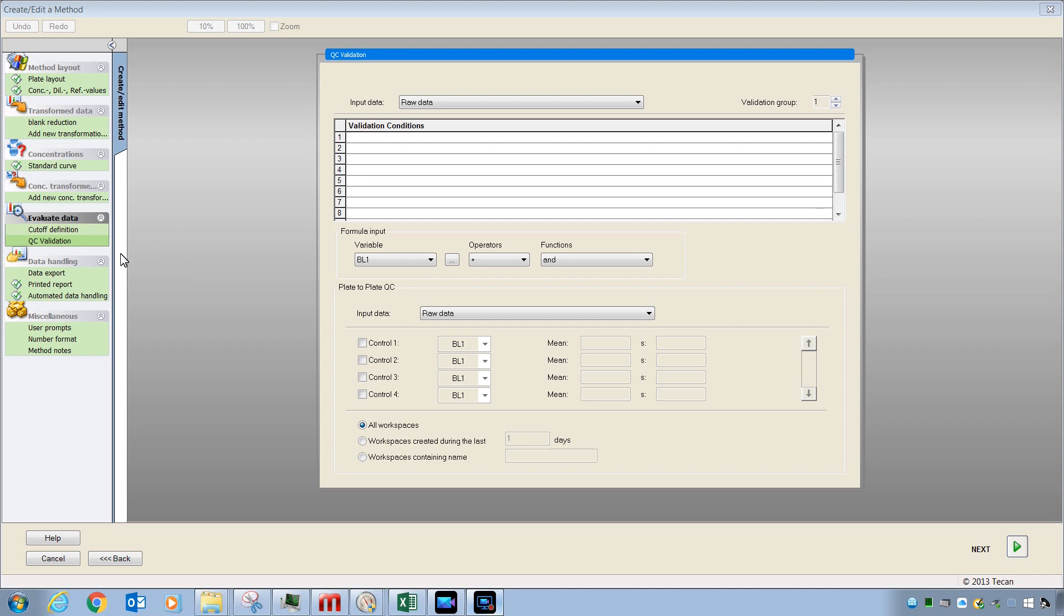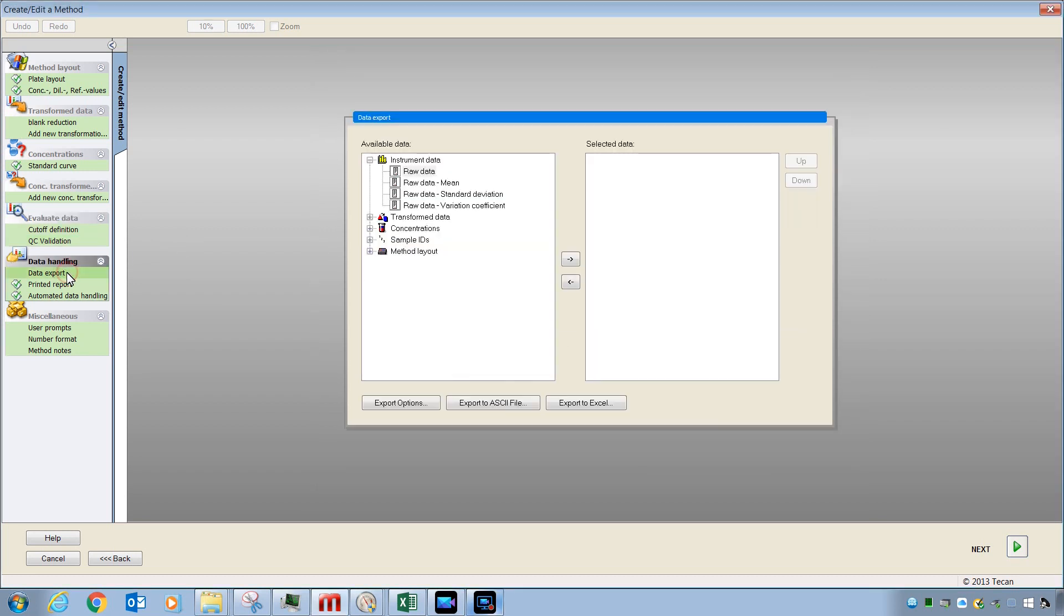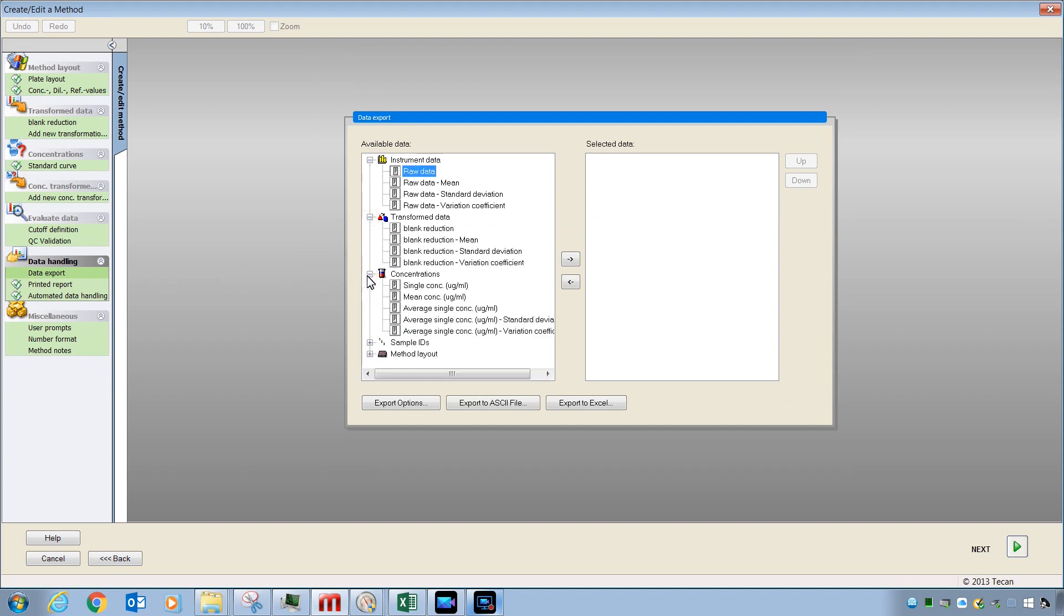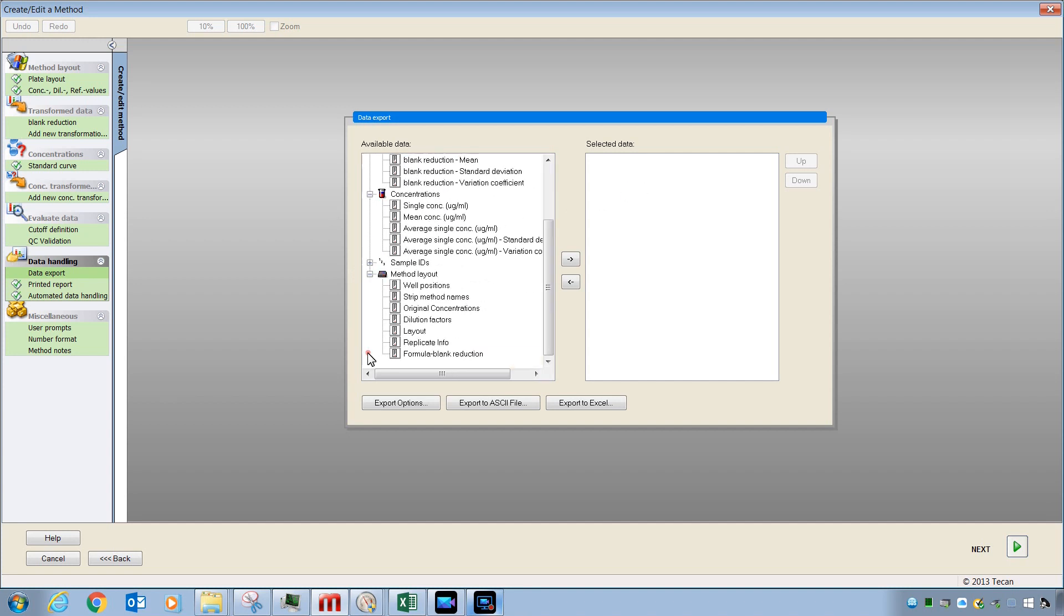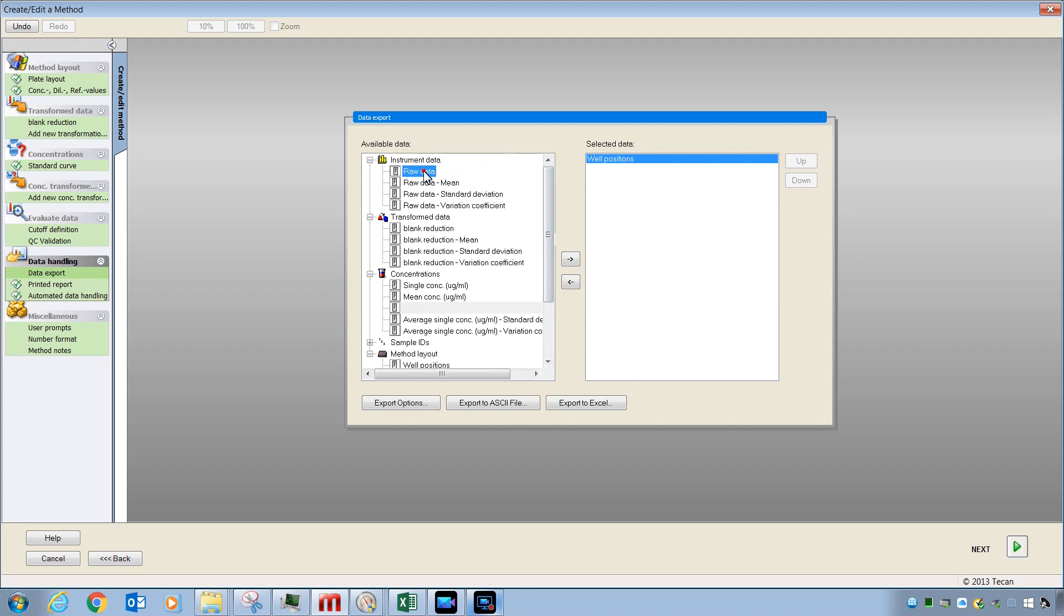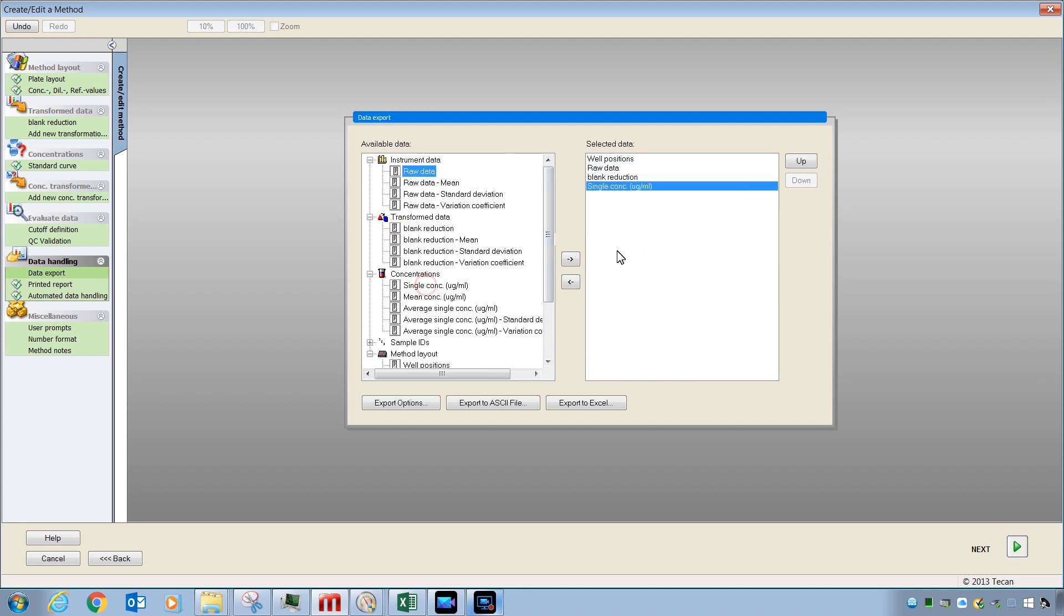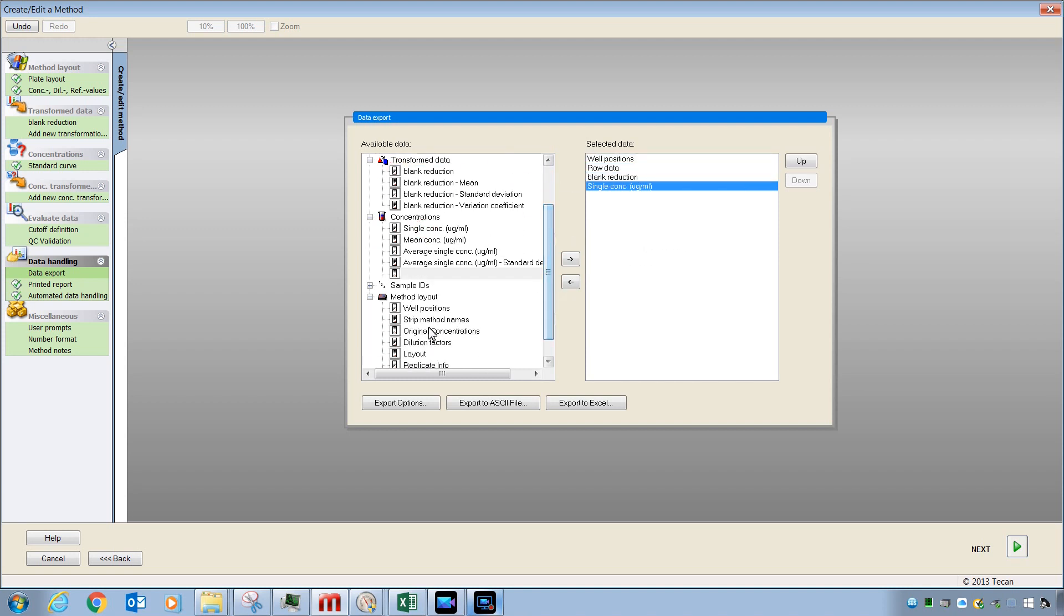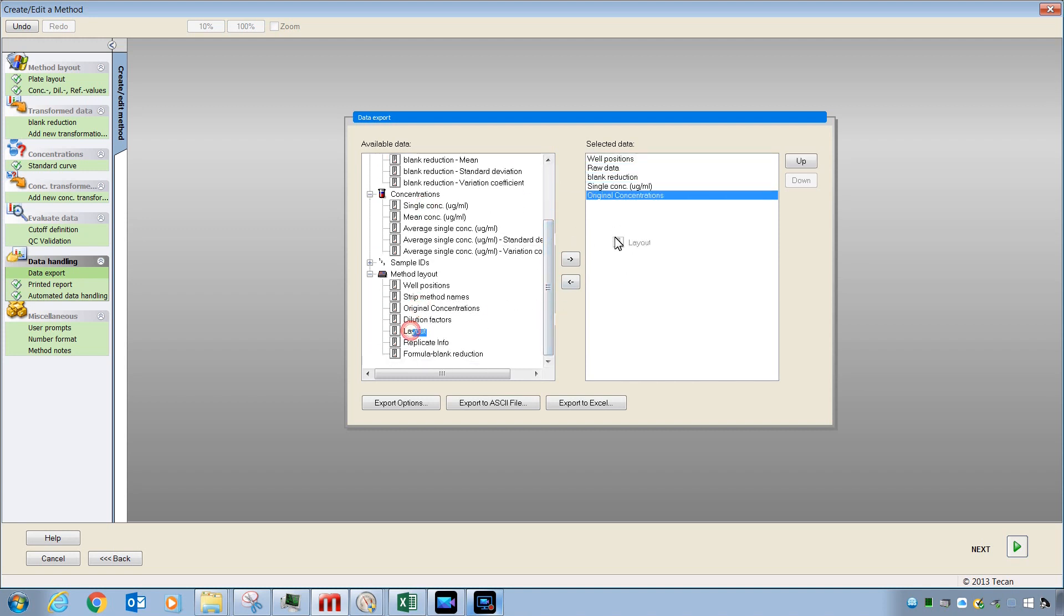If you would like to export data to Excel or print your data, it is here under Data Handling that you will want to address these choices. Data Export allows you to see all the available data for export and take from the left-hand column here drag and place the data in the order that you want it to be exported. Here is one example.